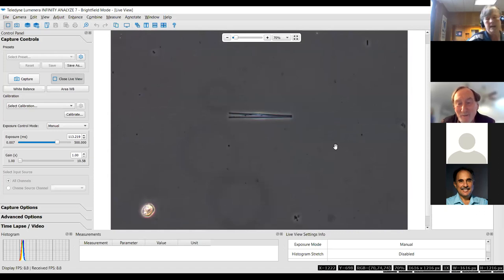And if you see a diatom do this, it's dying. So those are the two valves that have come apart. And so there's no cell contents there, that's dead.